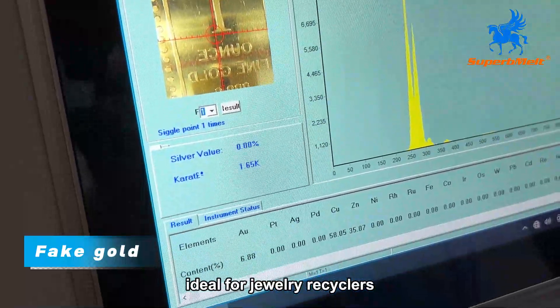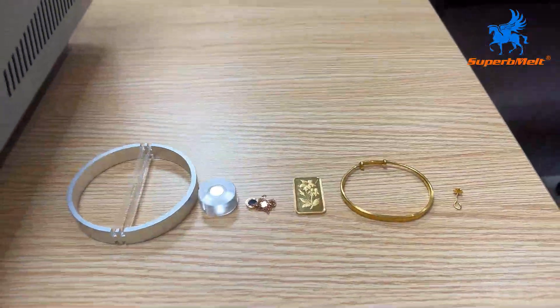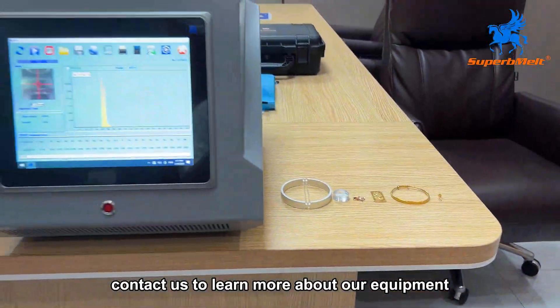Ideal for jewelry recyclers and quality inspection professionals. Contact us to learn more about our equipment.